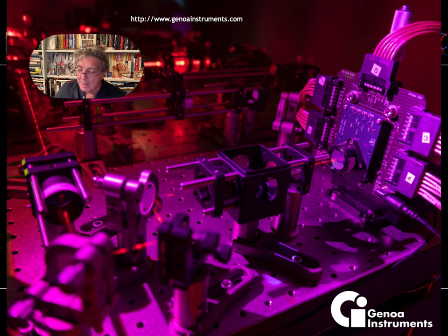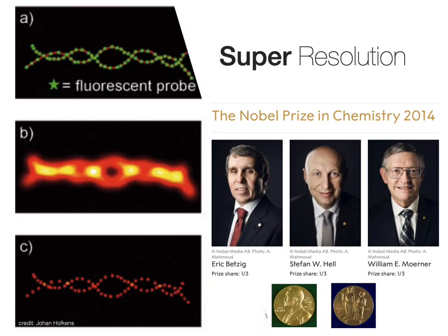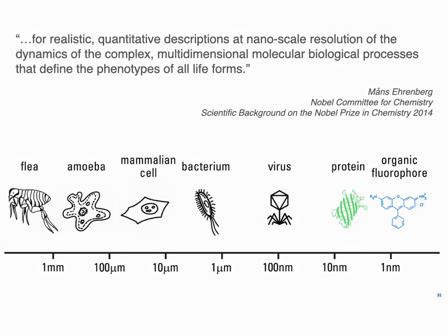Well, let's switch again to super resolution. You know about the Nobel Prize 2014. And the motivation is a great motivation: a realistic quantitative description at nanoscale resolution of the dynamics of what's going on in biological processes. Come on, this is what we would like to do.